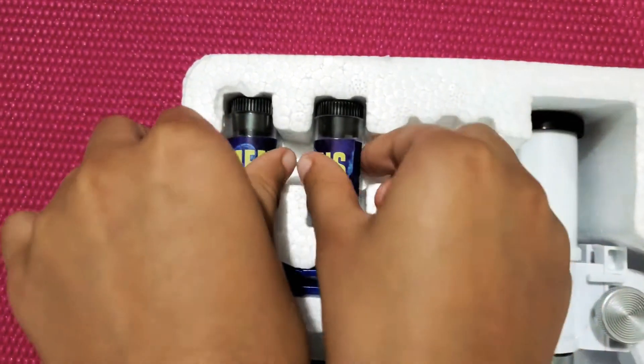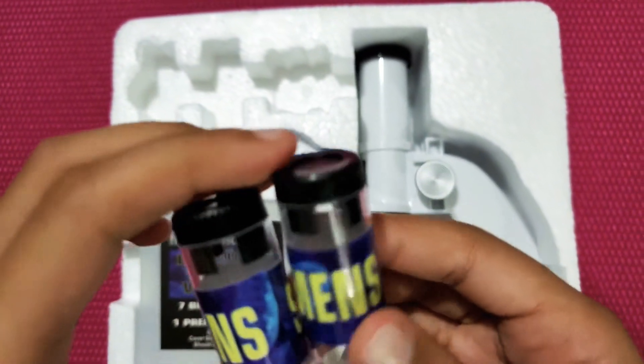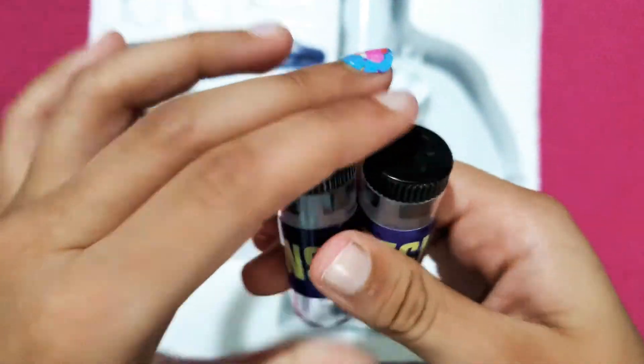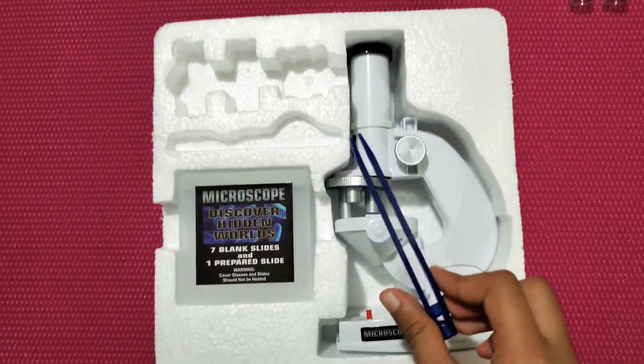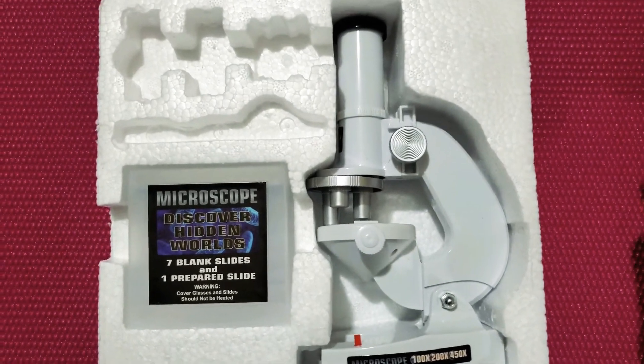Here we have some empty cups — specimen containers. They're both empty. Here we also have tweezers — they're blue. Let's put them aside.